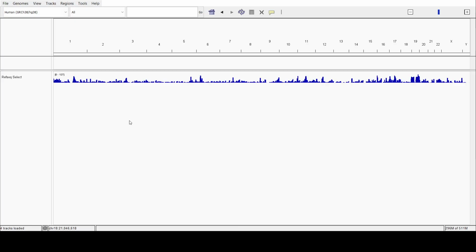Okay. So remember our jigsaw puzzle metaphor from previous videos. Before we look at our pieces, we have to show IGV the picture on the puzzle box. That is our reference genome. So you can load up your own reference genome. You can find that reference.fasta file that we used previously, or your own. And IGV will instantly create a chromosome track at the top of the screen. If you were working with human data, you could just select human HG38 from their built-in drop-down menu. As you can see, it's already loaded in here, so we will just be using that. It will automatically download the entire genome for your analysis.